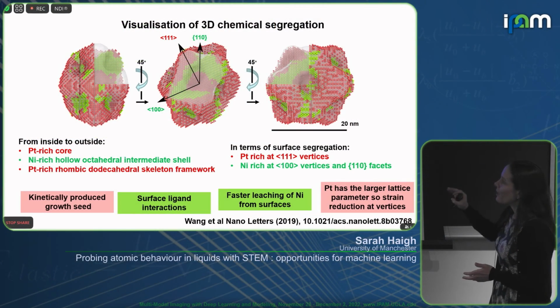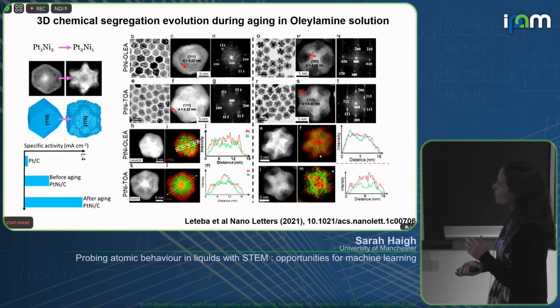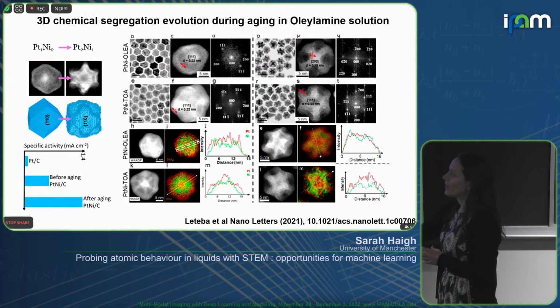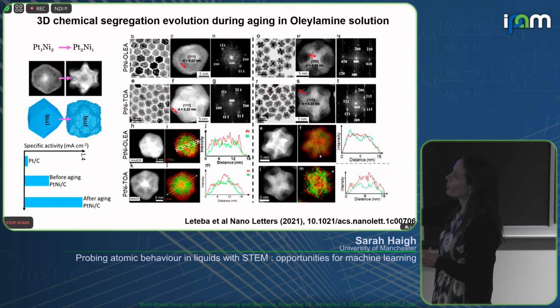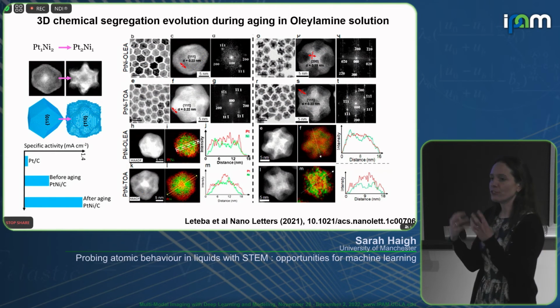this is quite a complicated elemental distribution. I don't need to go into the details of that for this audience, just to say that we've been working with the chemists more recently to understand how this can change the catalytic performance and how you can form these nanoparticles, which is a liquid phase reaction going from an original rhombic dodecahedral particle to this very faceted concave surface shape.